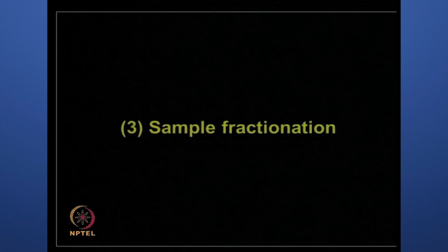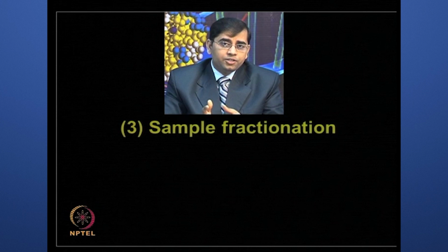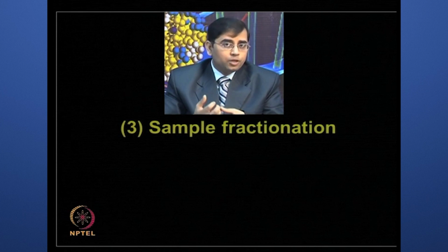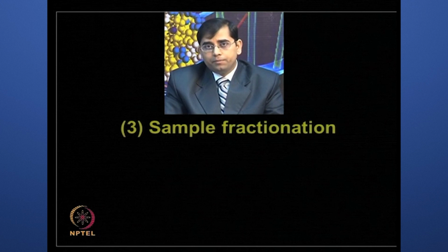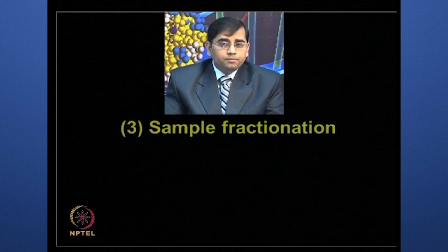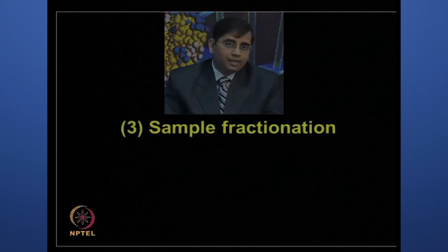As I mentioned in the beginning, depending upon your applications, you need to decide on a strategy, an effective way of obtaining all the proteins, so that you can study your biological problem in an effective way. For example, if you are looking at a proteome analysis for a particular organelle, then you need to fractionate your sample. Or if you are looking for a wide proteome coverage, but the proteome poses a lot of challenge in separating all the proteins simultaneously, then one needs to do fractionation to reduce the complexity of the sample.